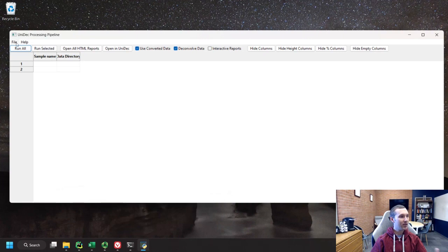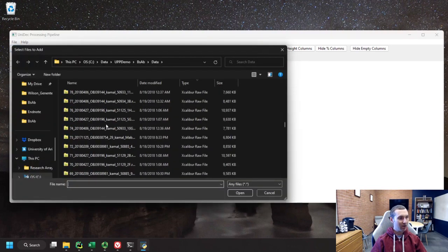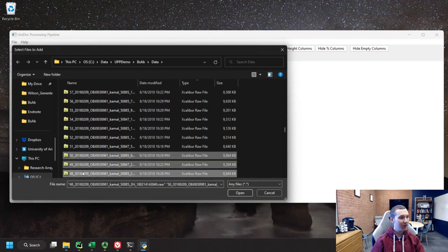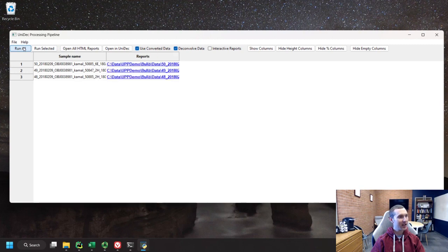Under File, you'll see there's Open and Save for opening and saving Excel files, and also adding data or clearing the frame. If we add some data, we can pick a few files and open them. It fills in the sample name and the data directory. We can go ahead and run all, and in the background it's running — it takes about a second per file and turns green when done. It automatically hides the data directory column, which you can show if needed.